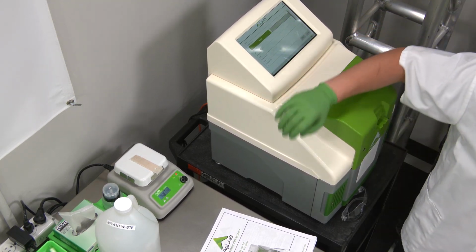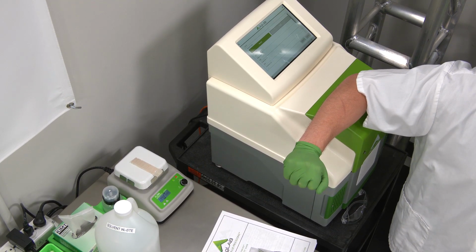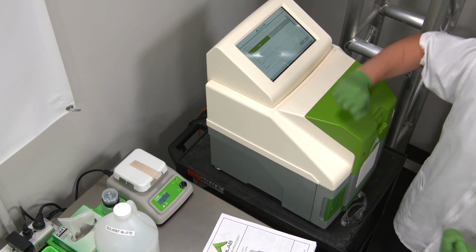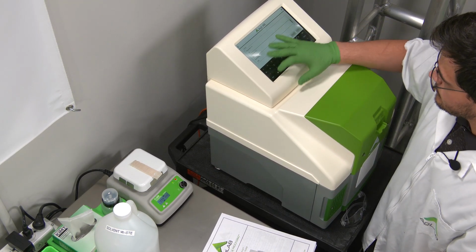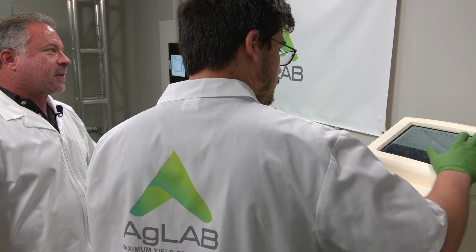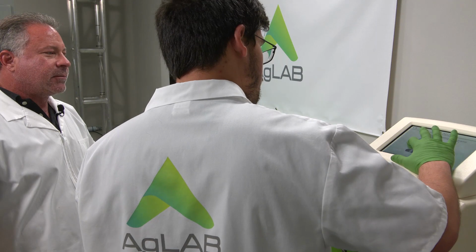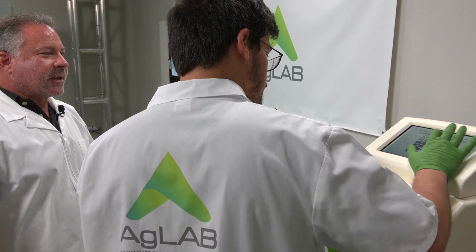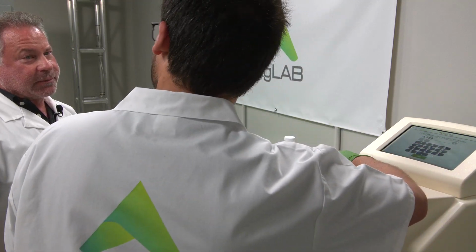Okay. What parameters did we change? We changed the evaporator down to 140. Okay. And why did we go lower on the evaporator? Trying to reduce the amount of energy put into the system. Okay. So hopefully reducing the amount of cannabinoids being pushed into the distillate stream or our lights.